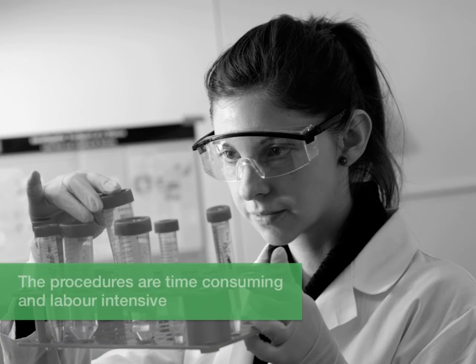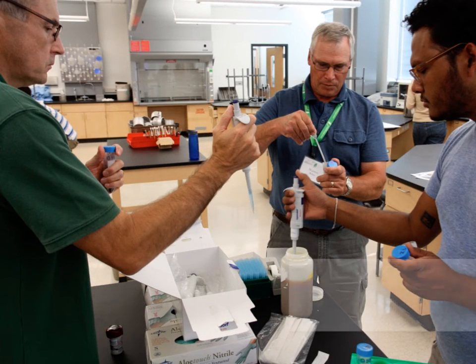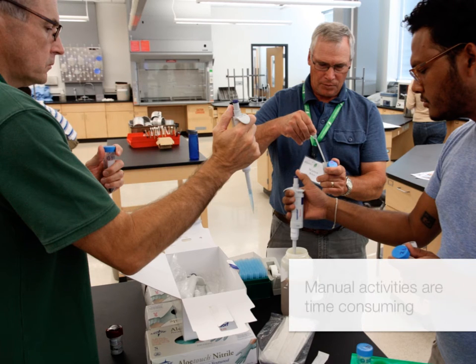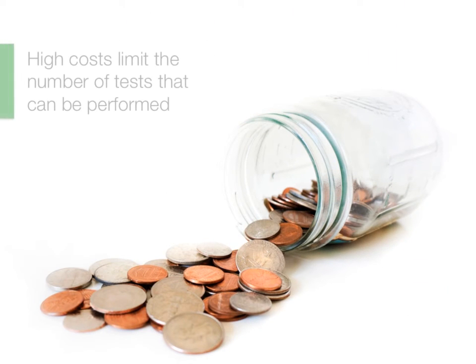The procedures are time-consuming and labor-intensive. The high number of manual activities leads to tests that are time-consuming and labor-intensive for the lab worker. This, in turn, increases the cost of the test procedure, thereby limiting the number of tests that can be performed.